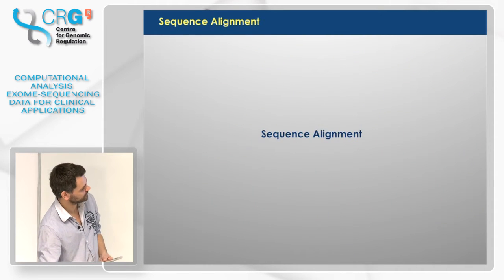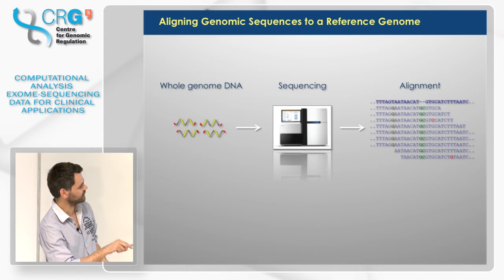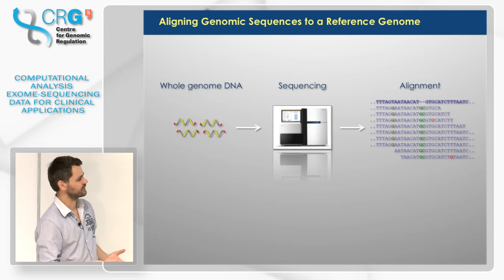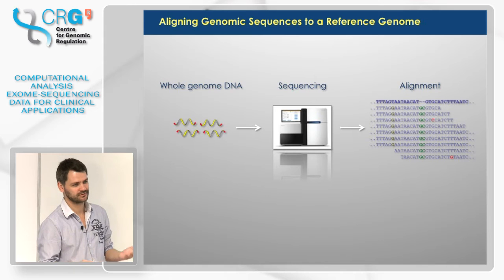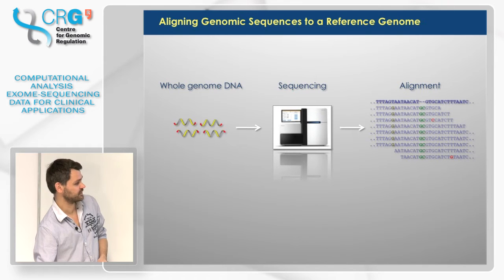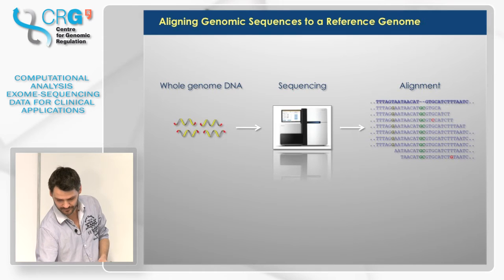Then in the next step, when we decided that the sequence is good, we want to bring the reads onto the genome, on the reference genome. And as we do resequencing here, we need a reference genome, here in bold. Without a reference genome, you would have to use other techniques. You would first have to make a reference by assembling your genome. For most genomes you might be interested in, there is nowadays a reference genome, but it's not the case for all.